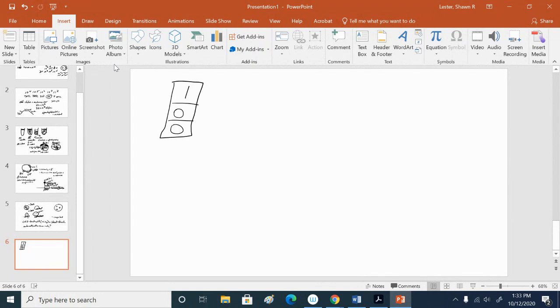Is it 10 microliters? Yep. If this was the 10 to 100 microliter pipetter, what's it set for? 100 microliters? Yep. And if this were the 100 to 1000 microliter pipetter, what's it set for? 1,000? 1000, right?